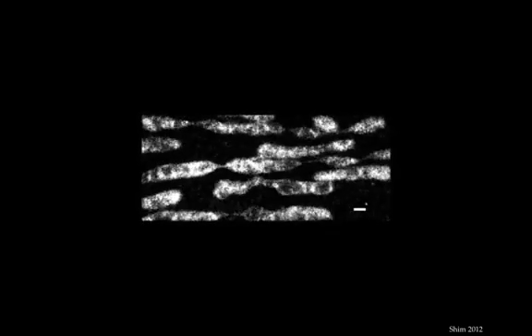In particular, the mitochondria STORM videos that they took showed potential intermediates to fission and fusion processes. You can see these as the thin tubular connections being formed and broken between neighbors. Remarkably, they were also able to see some transitions between the morphologies that we observed with Huang's work. This STORM video takes place over a minute, and in the course of it, we can see the thinner elongated network that's initially in place gradually becoming blobby and breaking up. This is probably a response to the photostress of imaging.